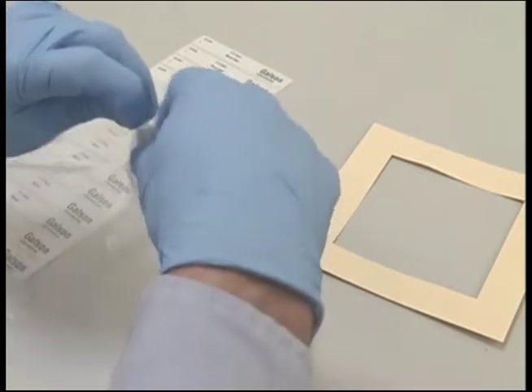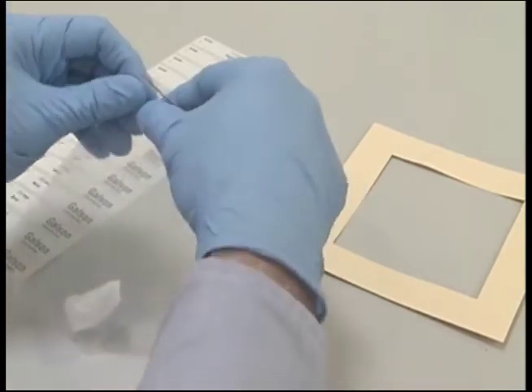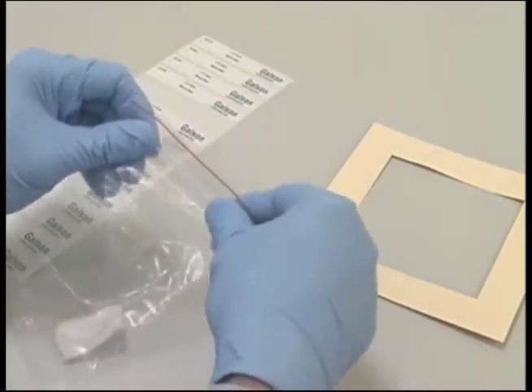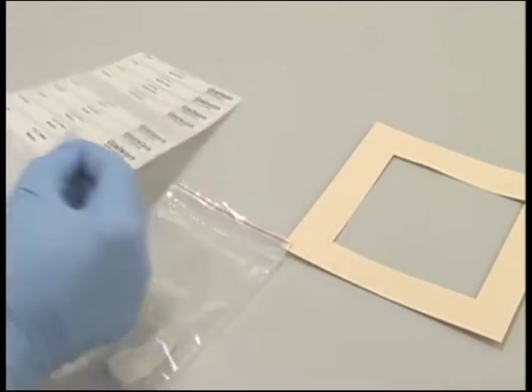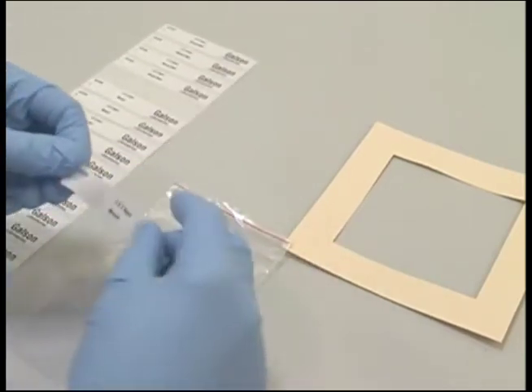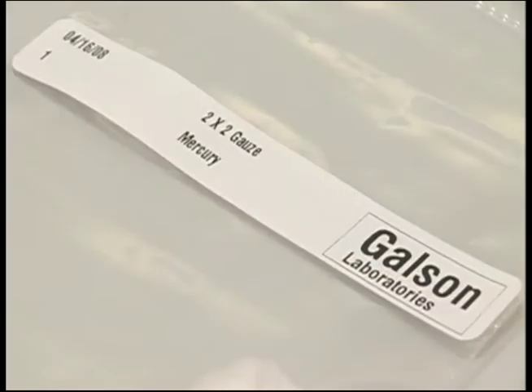After you have completed the sample collection, fold the wipe sample with soiled side facing in and place it into the supplied collection vial or ziplock bag. Identify the sample by placing a Galson-provided label or equivalent on the outside of the vial or ziplock bag.